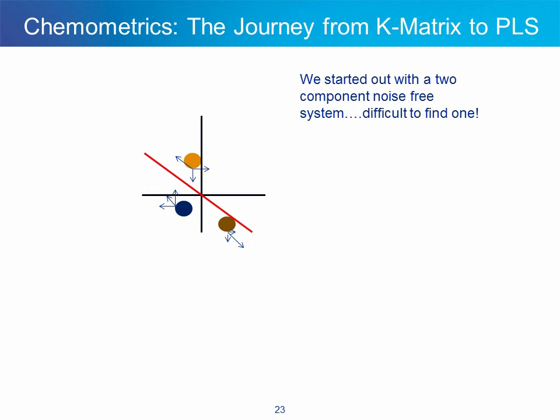Often, reaction data will have more than adequate signal-to-noise, enabling good detection limits. However, there is no such thing as a completely noise-free spectrum. There will always be noise introduced by the optics and electronics of any spectrometer. In addition to moving on the axis that is coincident with the plane of the slide, the data will move on new noise-induced axes as well. The first 2 axes or factors contain the useful chemical component information and to a lesser degree noise. The third axis or factor, which we have drawn here in red, contains only noise, no useful chemical information.